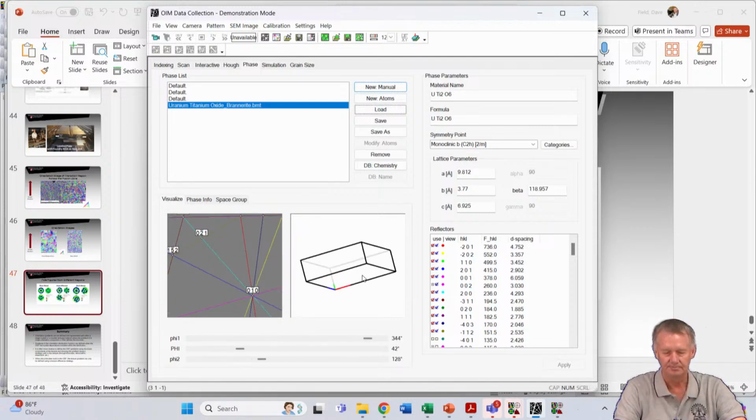So that's in terms of indexing, okay, and in terms of bulk texture analysis, because eventually whenever we get the pole figures, we have to index them. I mean, we need to compare with something, and there is actually very little literature which shows what we expect from a monoclinic phase, for example.